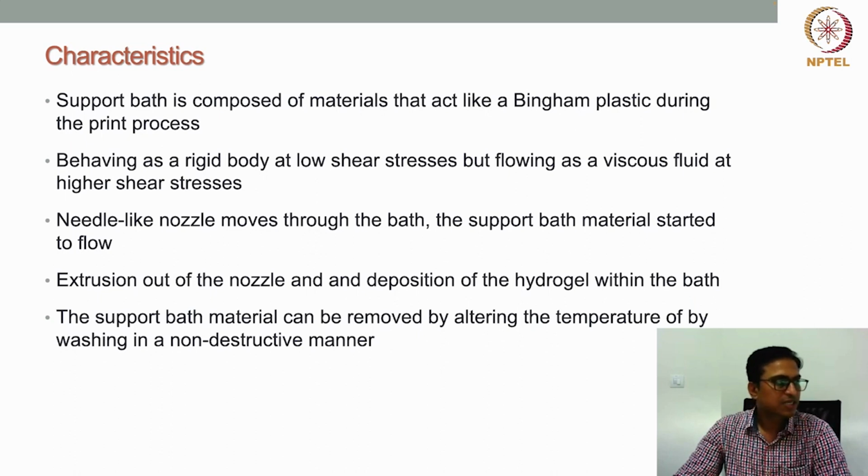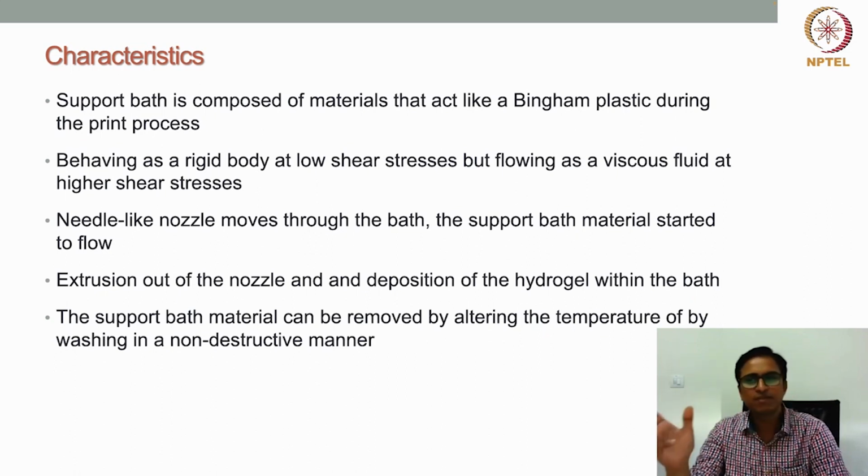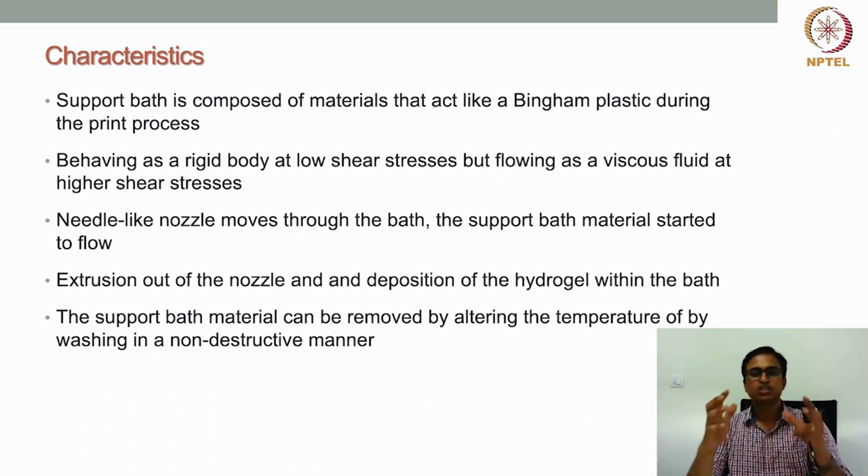The support bath is mostly made up of materials that act like a Bingham plastic during the print process. What is a Bingham plastic? A Bingham plastic is a material that behaves like a rigid body, a solid-like structure, when there is no shear load, no shear rate, or very little shear stress.